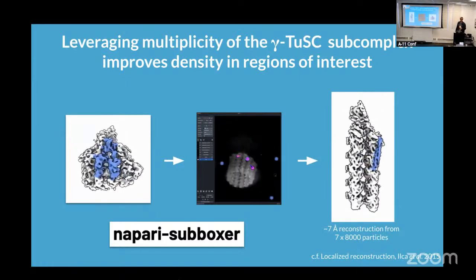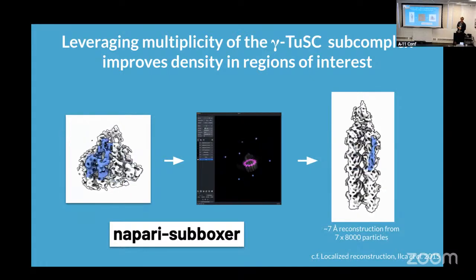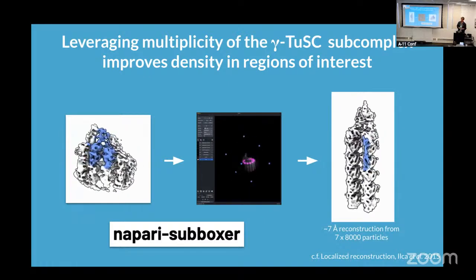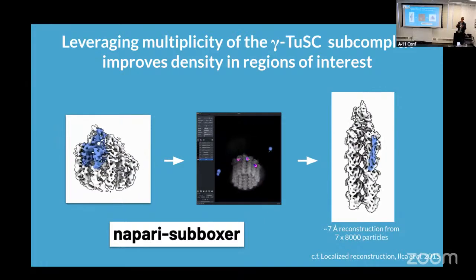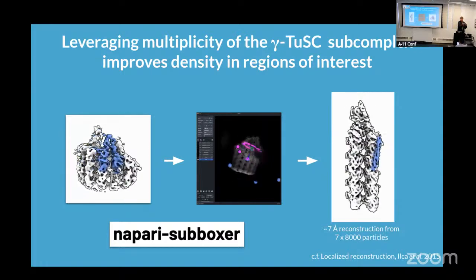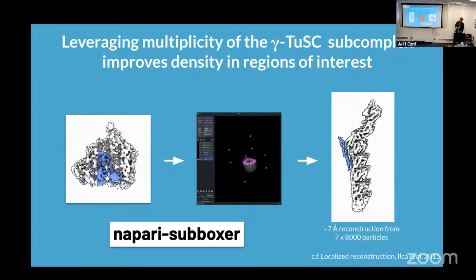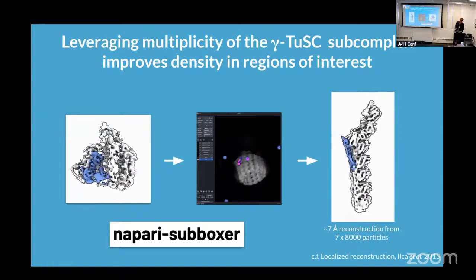They then went to a lot of effort to try and identify what that coiled protein was, and unfortunately, it was not 100% sure by the time the project finished up. But it was really fun, and I think it's a nice example of going the extra mile, thinking about the geometry of your system, providing more insight that led to hopefully being able to say a bit more about the biological system that you're interested in. And here we increased the particle number 7 times, so we ended up with about 56,000 particles, and things cleaned up really nicely.